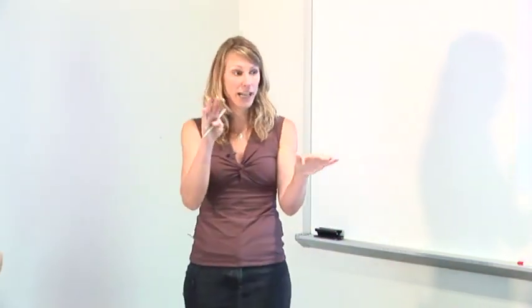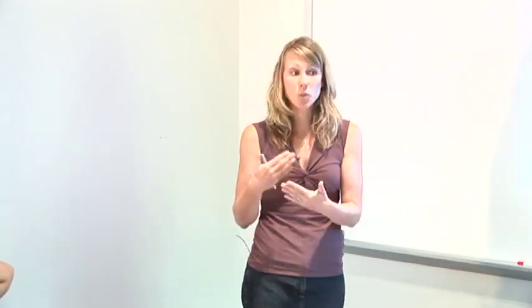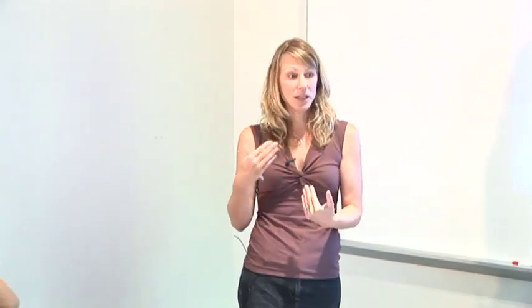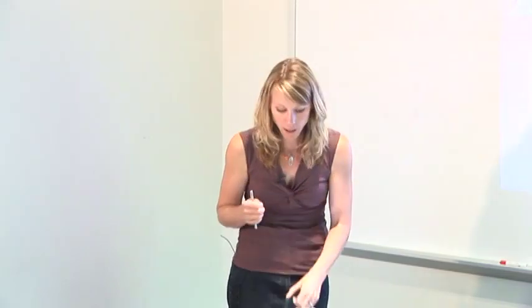So they're looking for matches, and then the search engine has to give you some level of how confident am I in this match. And that's where the search engines differ. So we can talk about that this afternoon, and we can base that conversation on each group, what types of analysis software you might be using or have access to.